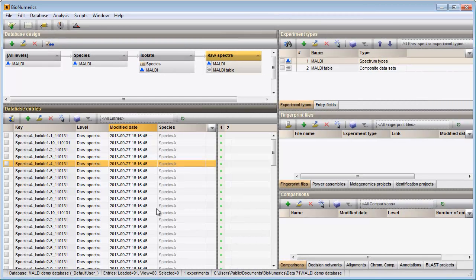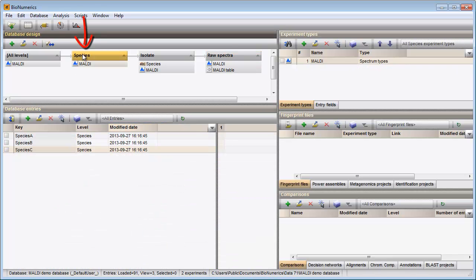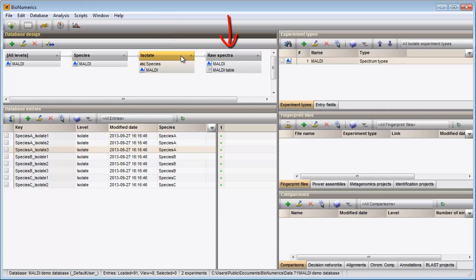In this video I will perform a PCA or Principal Component Analysis on the MALDI dataset in my database. As you can see in the Database Design panel, three levels are present in my database. My dataset consists of spectra from three species, for each species several isolates have been analyzed, and for each isolate there are multiple technical replicates.